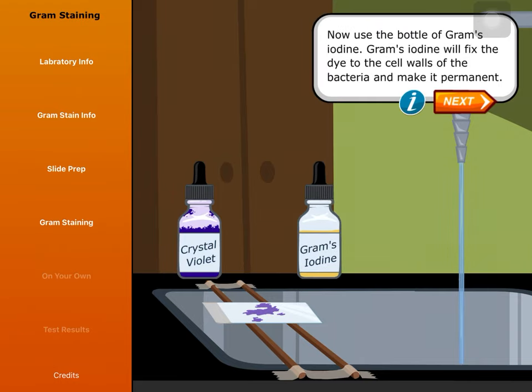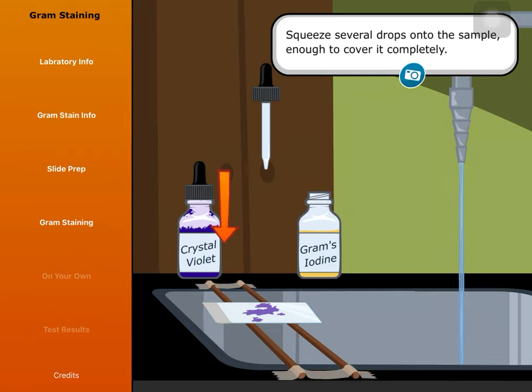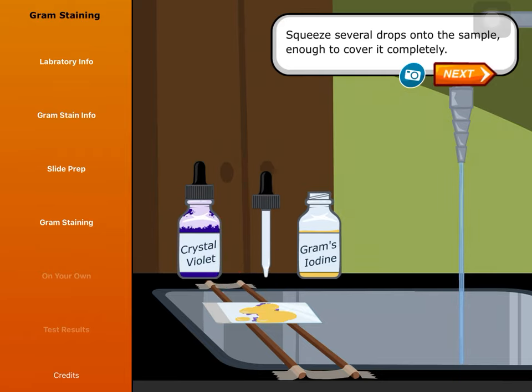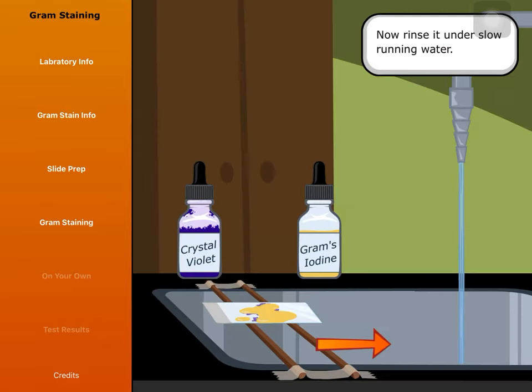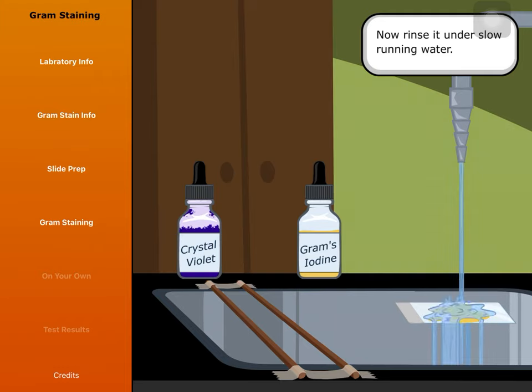Now use the bottle of Gram's Iodine. Gram's Iodine will fix the dye to the cell walls of the bacteria and make it permanent. Squeeze several drops onto the sample, enough to cover it completely. Let that sit for 60 seconds, then rinse it under slow running water.